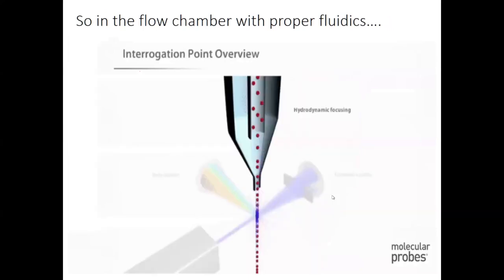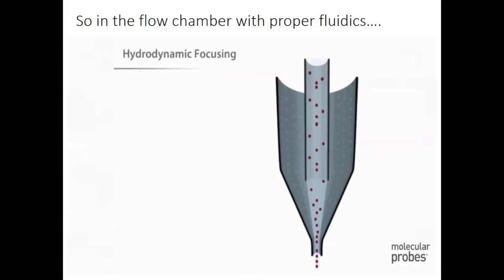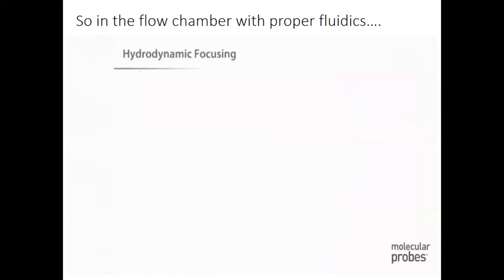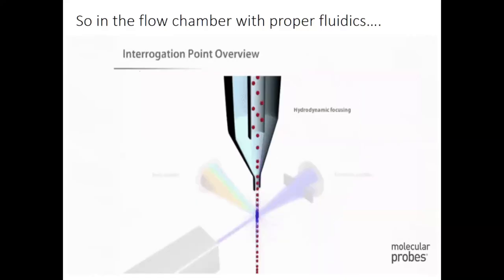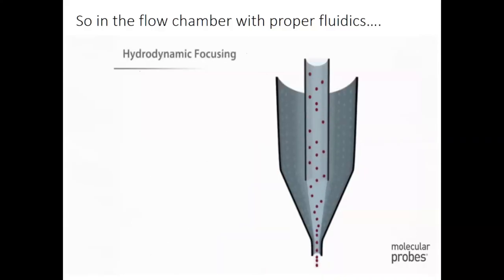I have a doubt: if you are using distilled water, and it is connected with cells, it will disturb them, it will burst. That is true. That is why we normally use PBS, phosphate buffered saline, so that the cells are not damaged much. We have experienced that when you use hypotonic water, the cells tend to rupture. But when you have a water of equal pH and the same concentration as your cells, obviously the cells can be protected.